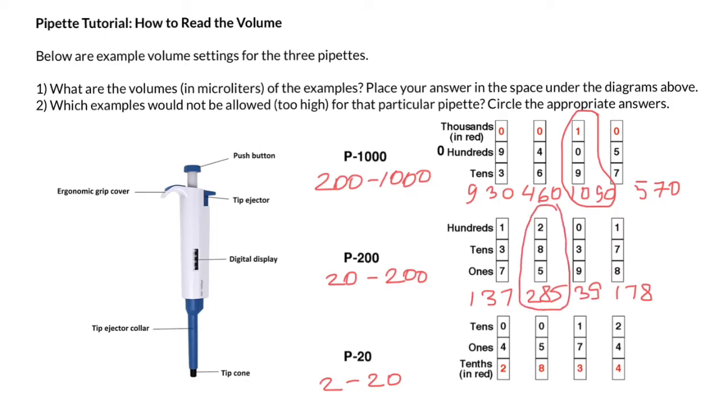And move to the next micropipette, P20. Range between two and 20 microliters. Again, these digits shown in red consider that we have here a decimal point. In this row we have tens, in this ones, and tenths is here. And first display represents 4.2 microliters. 4.2 microliters.